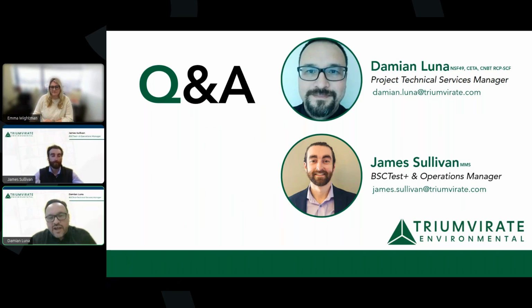We also have PAPRs that utilize the same protection. Obviously, the PAPR is a little different, typically used in a BSL-3 type environment, but it gives you a little more flexibility and isn't so cumbersome. So we do a mix. Really, I would look at whatever your process is, and comfort can definitely be a factor. If someone's going to be in something all day, they probably want a PAPR because the full face is just a little much.